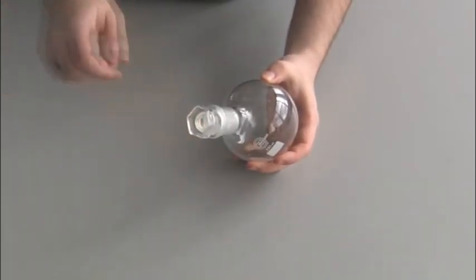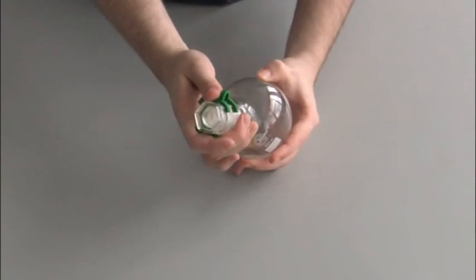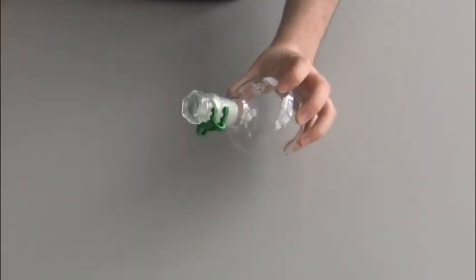Quick Fit Glassware is designed such that the joints fit together quickly and easily, giving a secure seal. Here we see a stopper being clipped onto a flask.